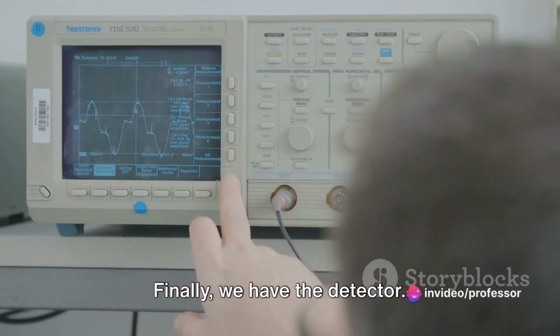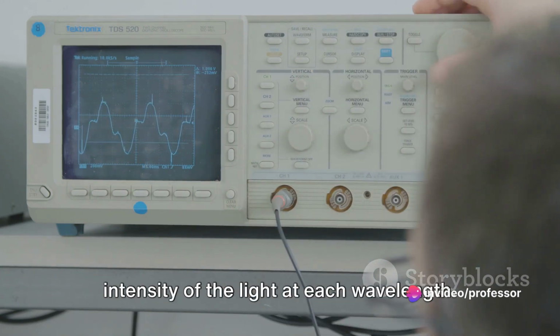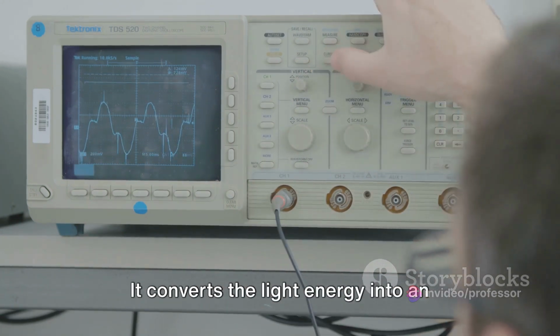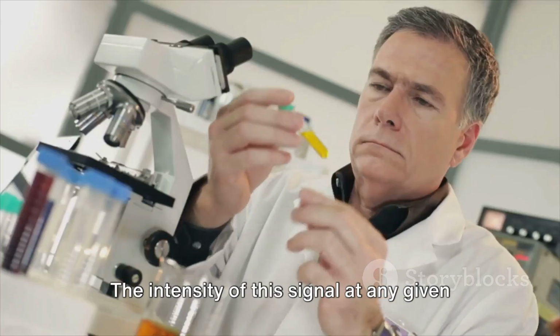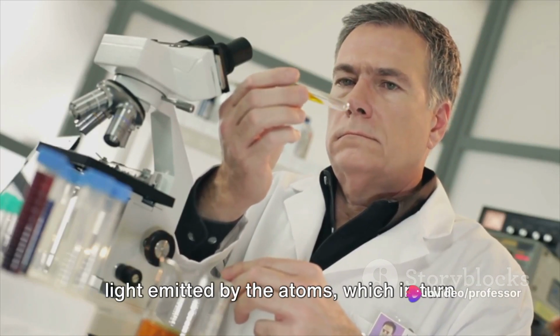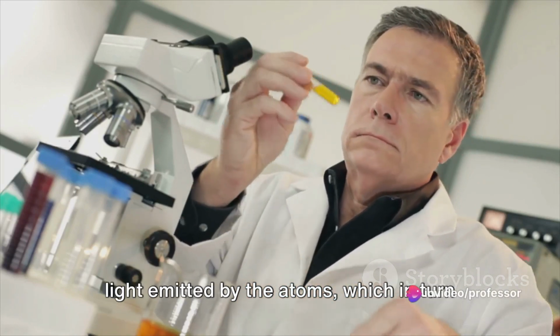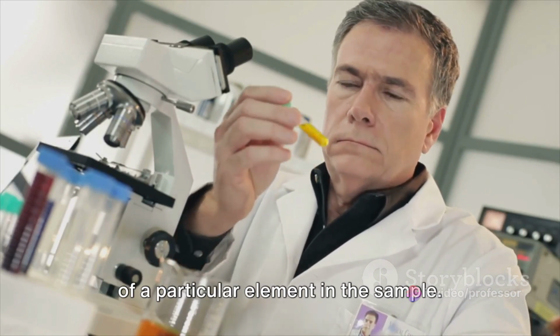Finally, we have the detector. The detector's role is to measure the intensity of the light at each wavelength. It converts the light energy into an electrical signal that can be processed and interpreted. The intensity of this signal at any given wavelength corresponds to the amount of light emitted by the atoms, which in turn can be used to determine the concentration of a particular element in the sample.